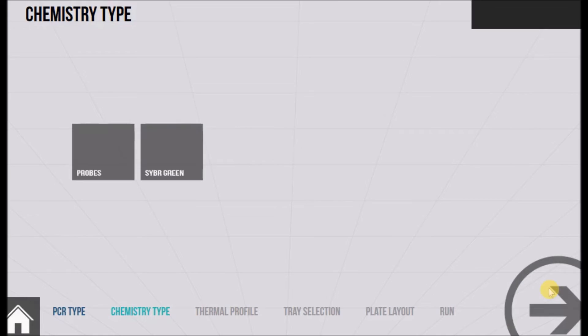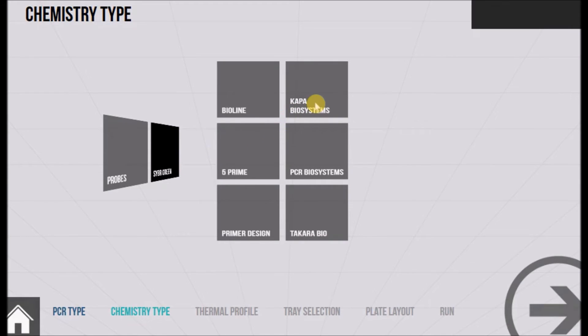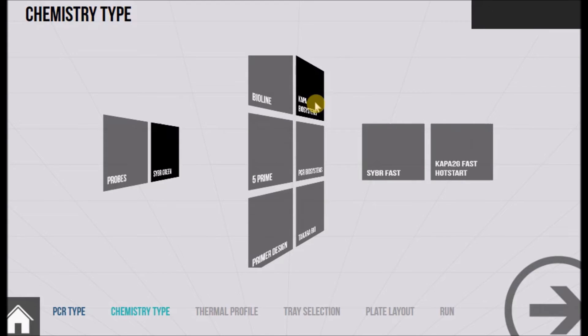On the next page select whether probe or SYBR based chemistry is being used. This brings up a list of some of the kit manufacturers that have been optimized on the Express machine. It's by no means an exhaustive list though. If you wish to use a kit manufacturer that isn't listed, simply choose custom PCR when choosing the PCR type on the previous page. Once you've selected a kit manufacturer it will bring up some of their products. Select one of these and press the next button.